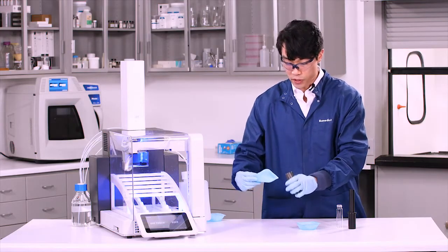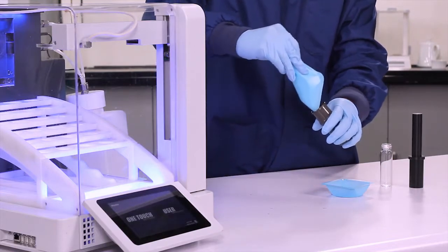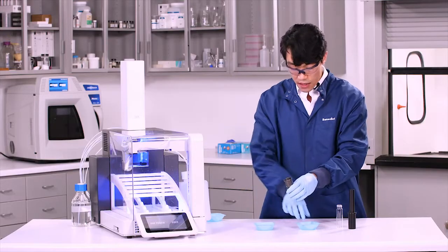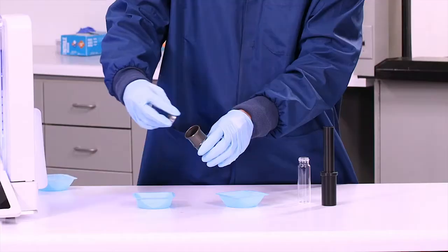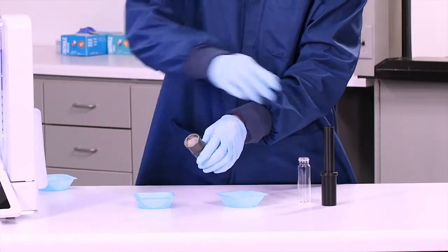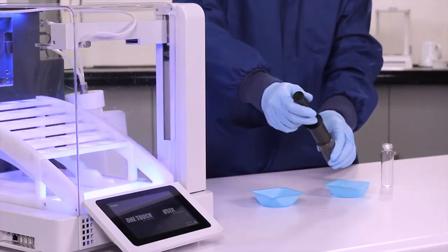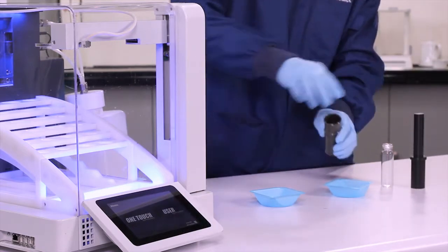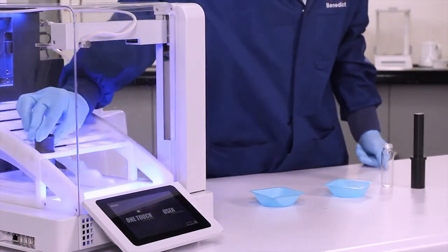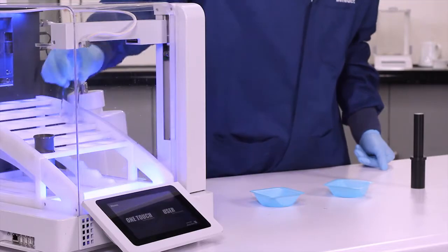Next thing we're going to do is we're going to pour our sample right into the Q-cup. Then we're going to insert a Q-screen, putting it into the opening, pressing down with the tool, and then inserting it into the Edge with the vial right beside it.